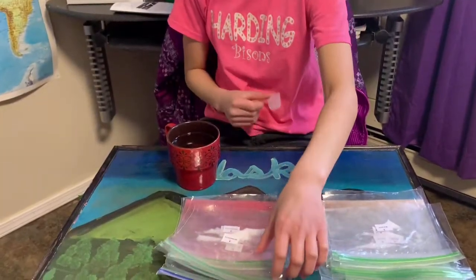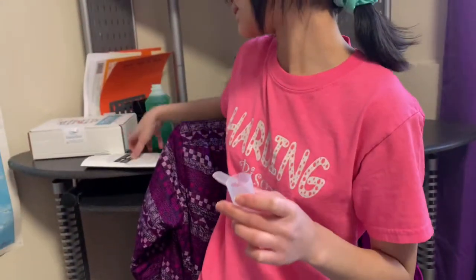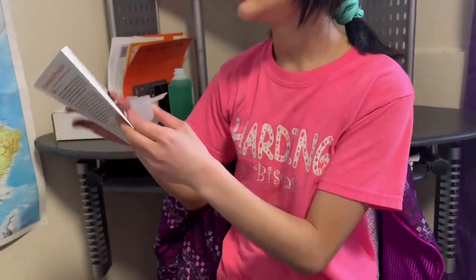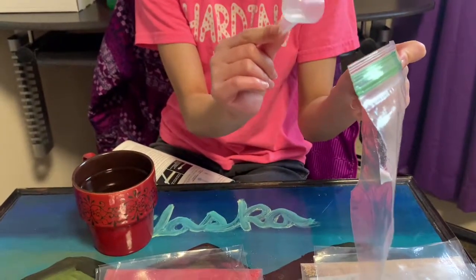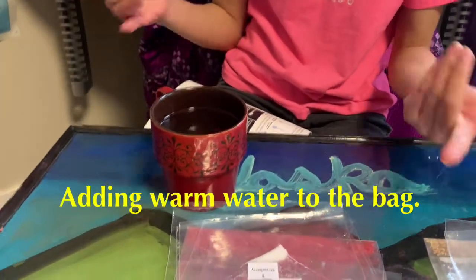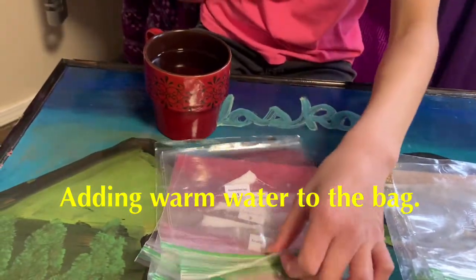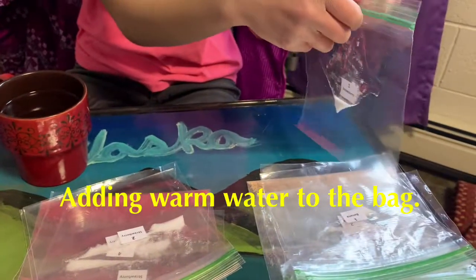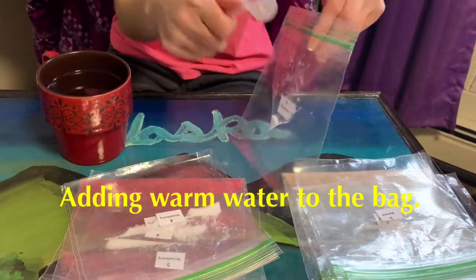Okay, now we're going to put some warm water. So this is 15 milliliters. This scoop is 15 milliliters, and we're going to put one scoop in each bag. And this is warm water. It's not hot or it's not cold. It's just warm. So here we're going to do number one, strawberry number one. We're going to put some warm water.